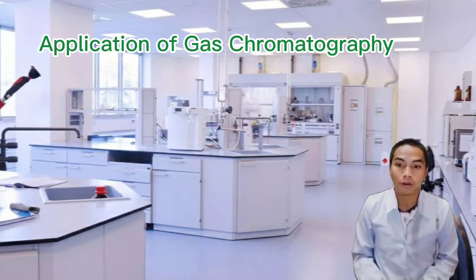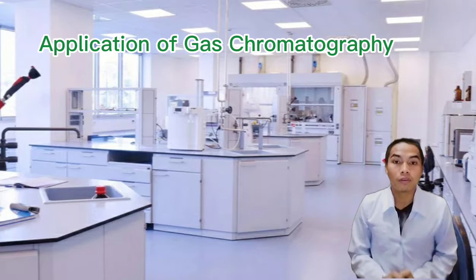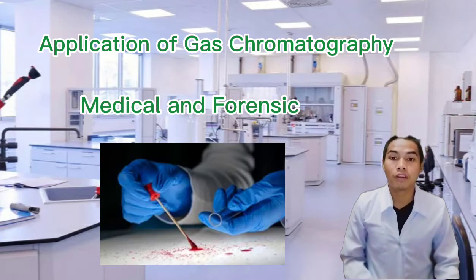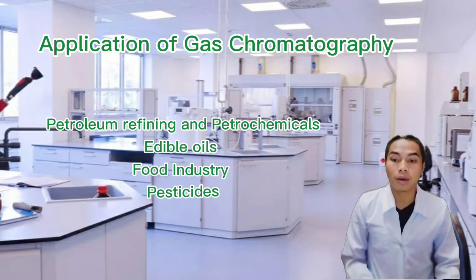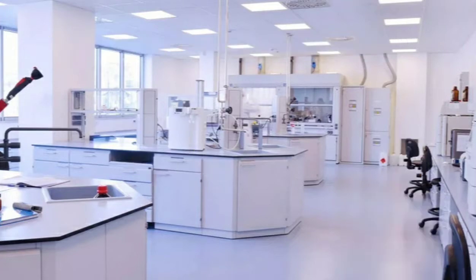Since the discovery of the gas chromatographic system, the areas of gas chromatography application are ever increasing, which include the pharmaceutical industry, research, medical and forensic, environmental monitoring, petroleum refining and petrochemicals, edible oils, food industry, and pesticides.